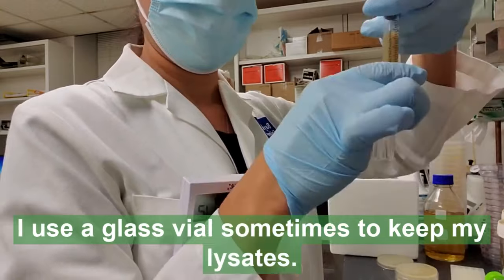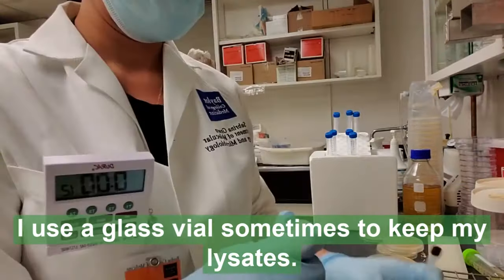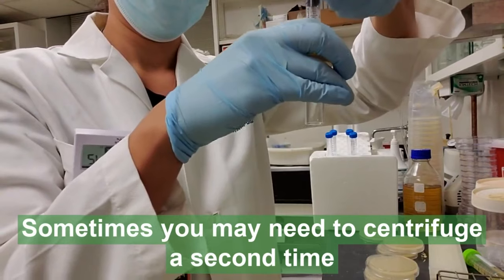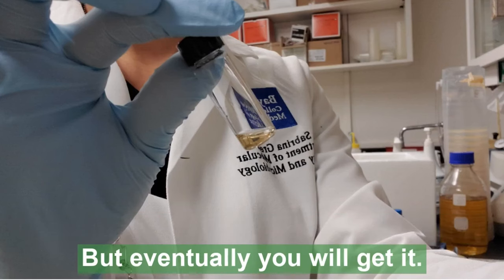I use a glass vial sometimes to keep my lysates and my phage. Sometimes you may need to centrifuge a second time to get it through that filter, but don't worry — eventually you will get it.